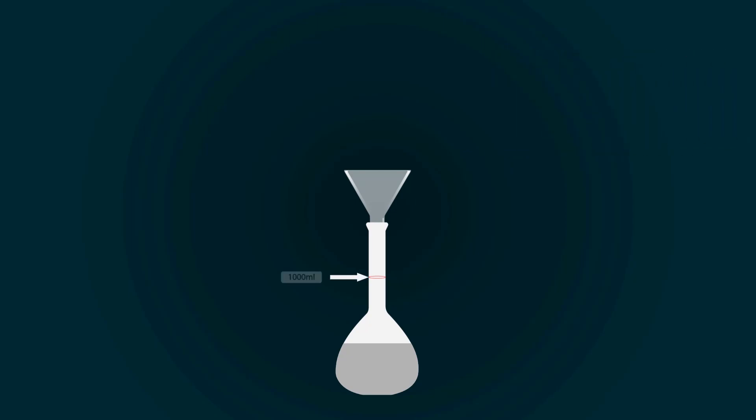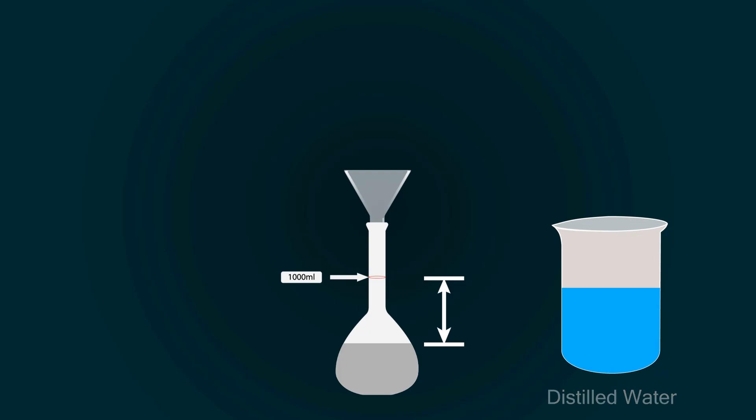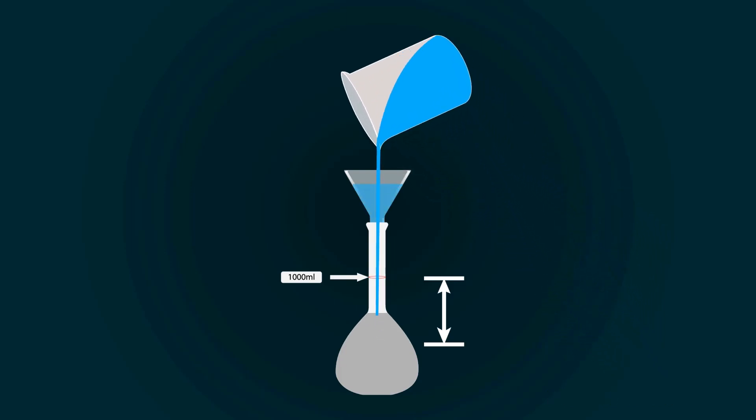You have to fill the volumetric flask up to the 1000 milliliter point. For that you have to add more distilled water. So, take more distilled water into an empty beaker and start pouring it into the volumetric flask.